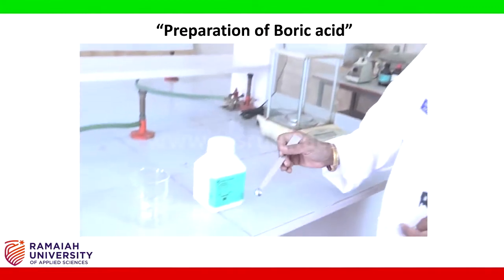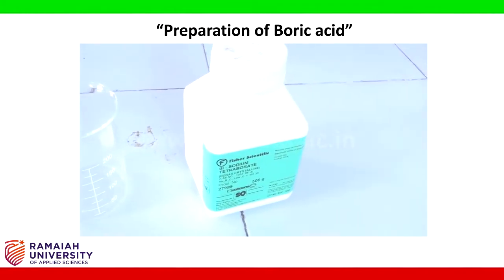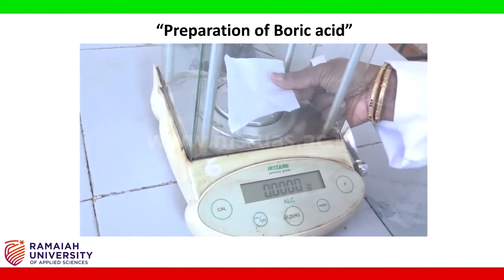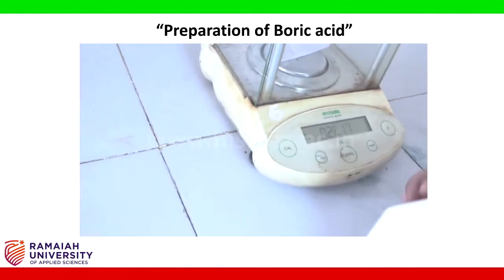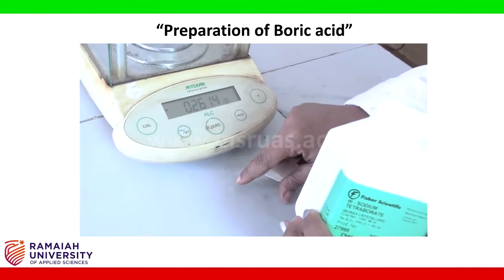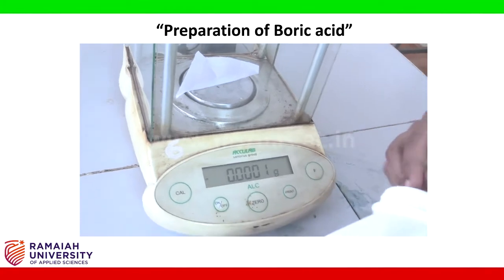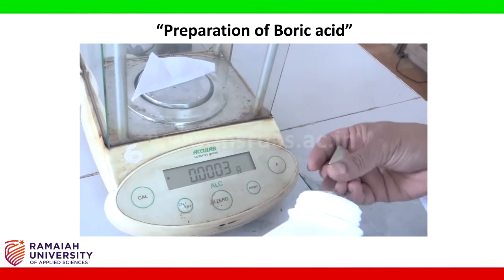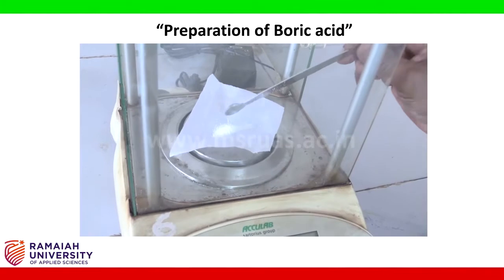First step is to weigh borax. Nullify the weight of the butter paper, then weigh approximately about 6 grams of borax.